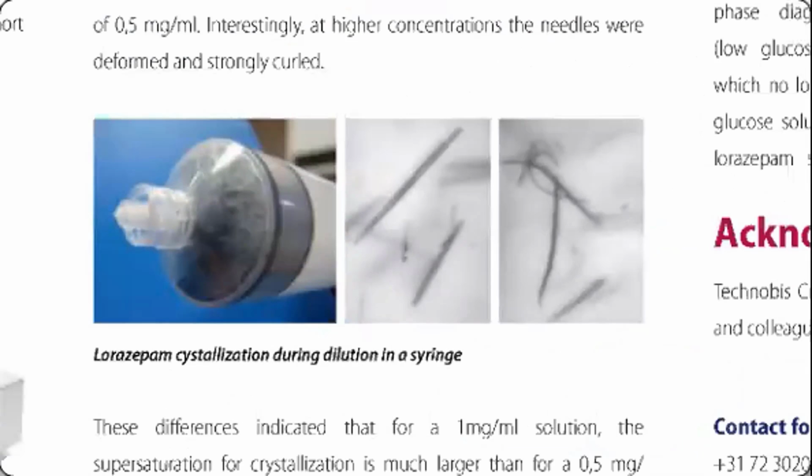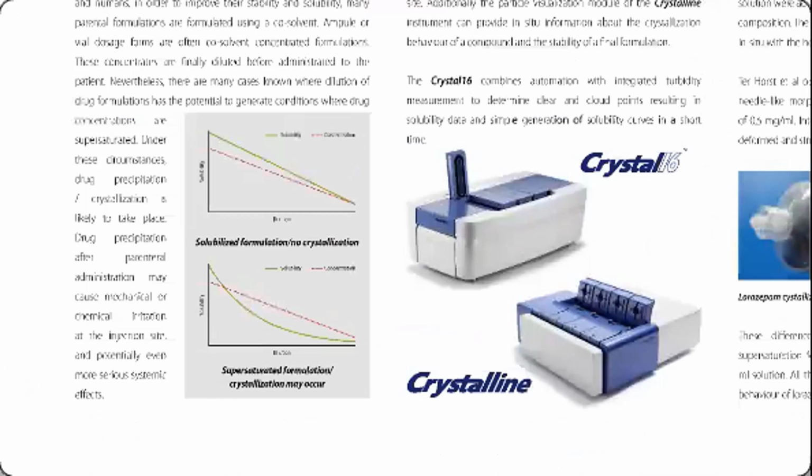The commercially available lorazepam solution is quite viscous, and therefore dilutions with aqueous sodium chloride or 5% glucose are always prepared before injection. When administered via IV, lorazepam was actually crystallizing at the injection site. Therefore, it was necessary to determine the solid-liquid phase diagram for the lorazepam in mixtures with aqueous glucose solution.